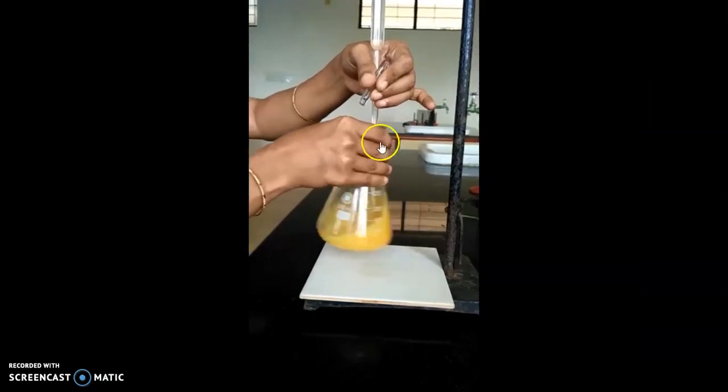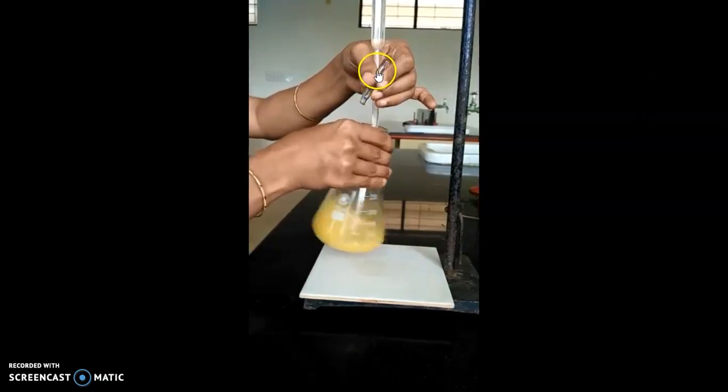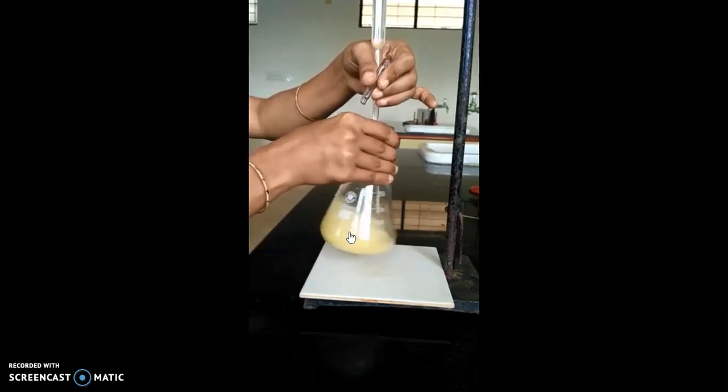Later, it has to be immediately titrated against hypo solution to make it to pale yellow color from yellowish-brown color.